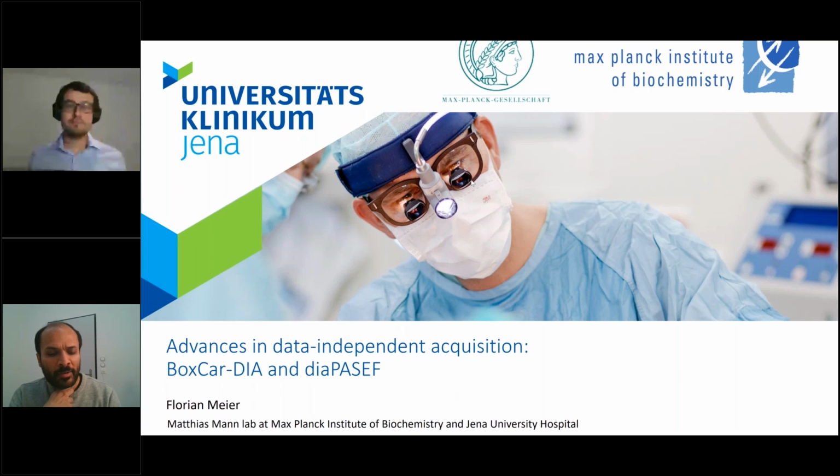Okay. Then I have one more question. In terms of future perspective, where do you see the current limitations of DIA-PASEF, and where do you see the immediate improvements possible? If you have something to say about that. I think that the technology is still very, very new, and it feels like we're basically learning every day, and there's certainly a lot of untapped potential in this scan mode.